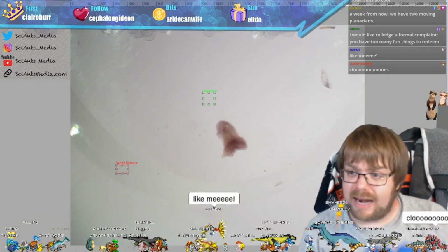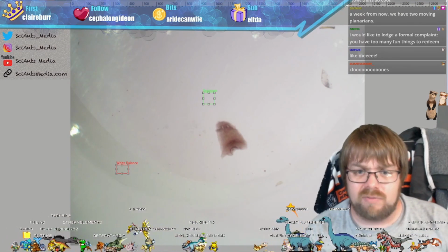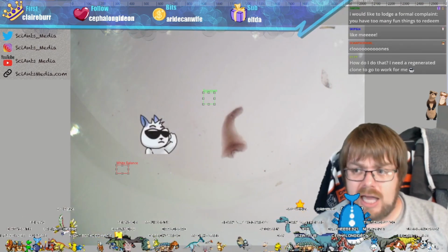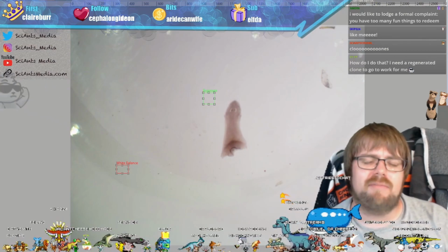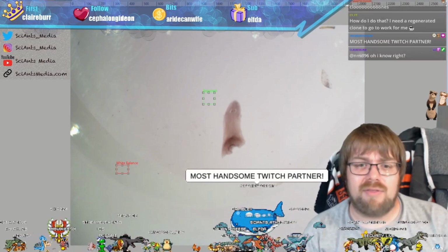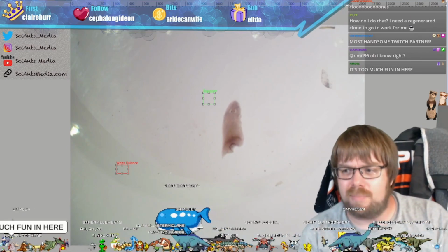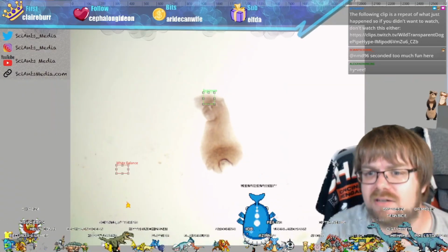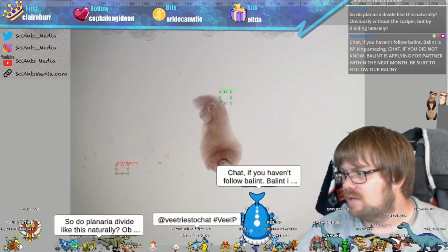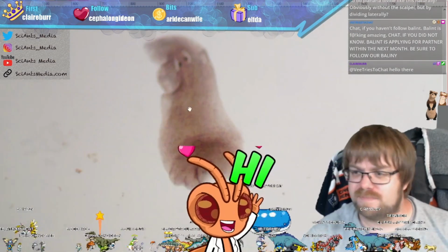So actually, Skip, they're even more closely related than you and Risto. So you and Risto are 50% identical. Ants are called super sisters. They are about 75% identical. Then these are clonal, and that's 100%. Look at that. It's totally sealed. Which I think is really, really cool that we already see that sealing behavior. Totally sealed up for the wound.